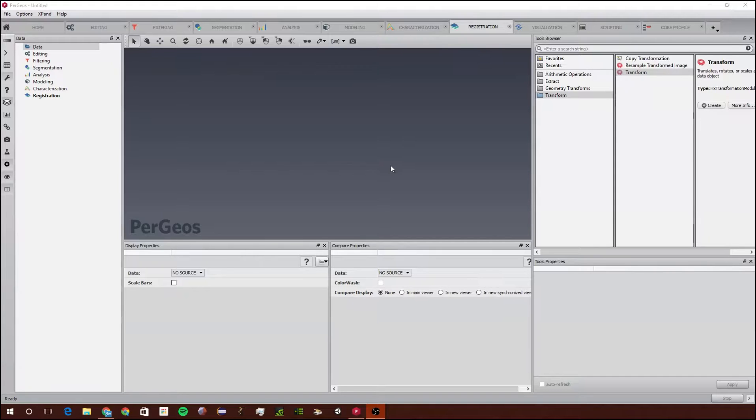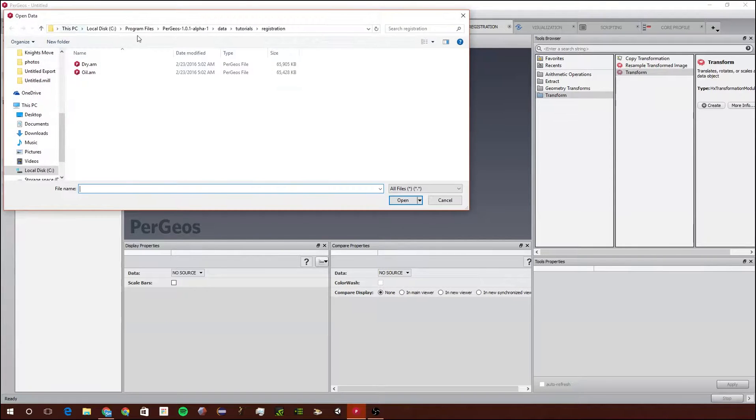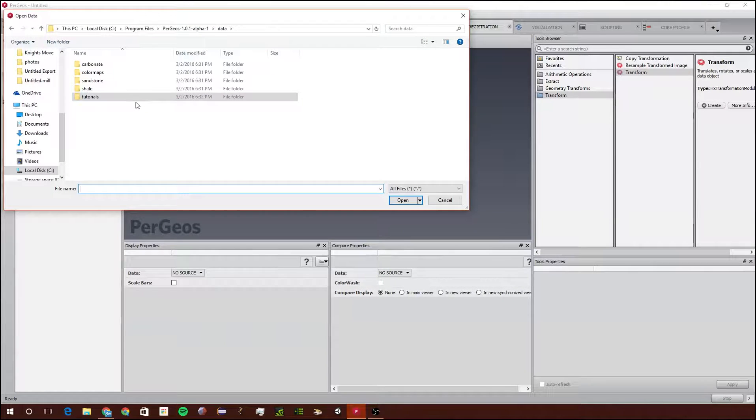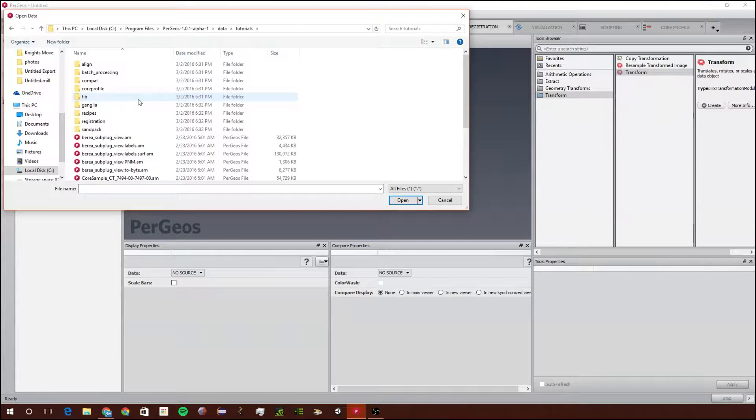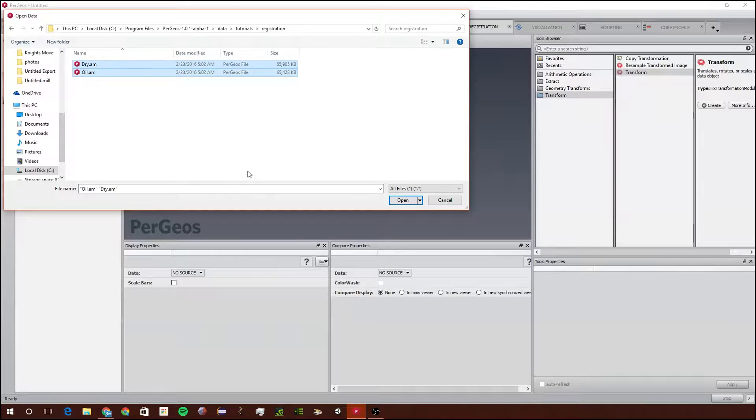First thing we're going to do is go to File, Open Data, and we're going to go into Data, Tutorials, Registration, and we're going to select both of those and click Open.